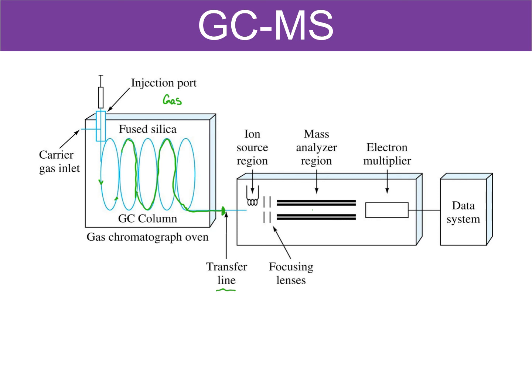And then those samples go through the mass spec, and ours is a quadrupole, like what's drawn in this diagram. And so we ionize our molecules, we run them through the quad, and we detect them. And out comes our different M to Z ratios.